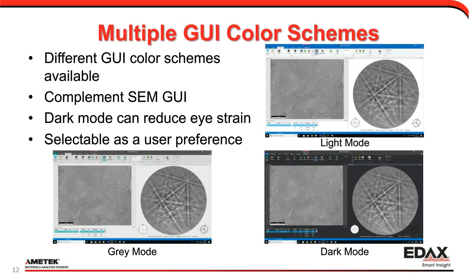The other thing that's surprisingly nicer than you would expect, I've grown to like this more and more, is that you can use different color schemes for the user interface. And so you can just get it to what's your preference. I think we're all more and more familiar with smartphones now, where you can customize your phone to get what you want. Software is following that same trend. So we're also able to complement the user interface that would be available on your microscope. It makes it look like a nice complementing tool.